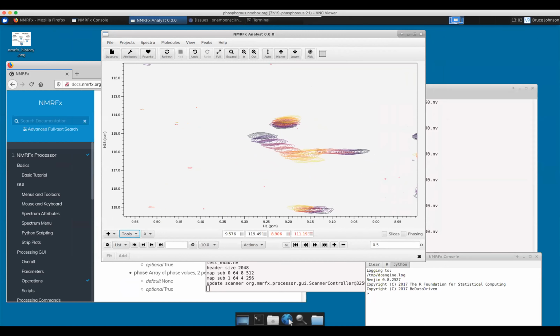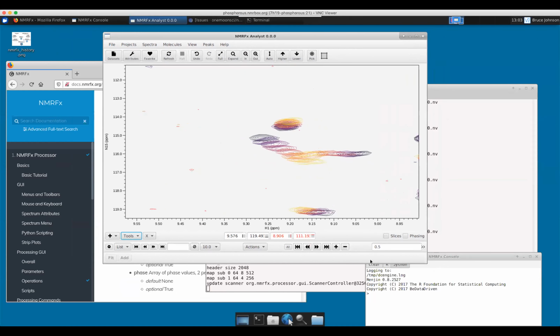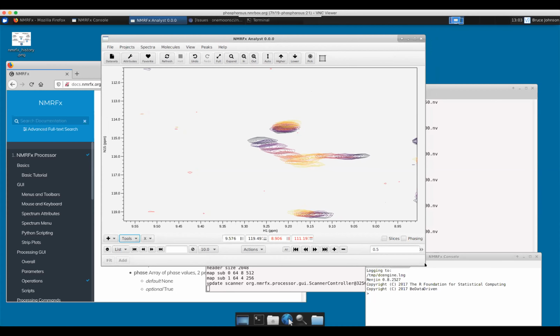As I said, this is a fairly... you can see my little thing. I'm trying to resize this window, and because I opened up some dialogue, it froze the window size. So actually, this is kind of in progress, but coming along pretty well.